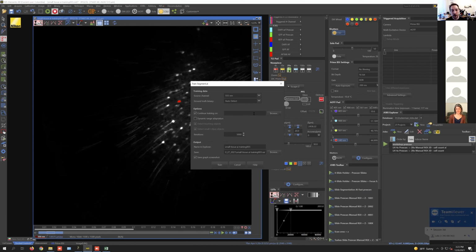And theoretically, this could lead to having something that's a little bit more robust across different neuron populations. So once you've done this training, it's not like you're stuck there and you have to start again for a new data set. You could just build on this network. And then, this 5,000 iterations is a reasonable starting point.